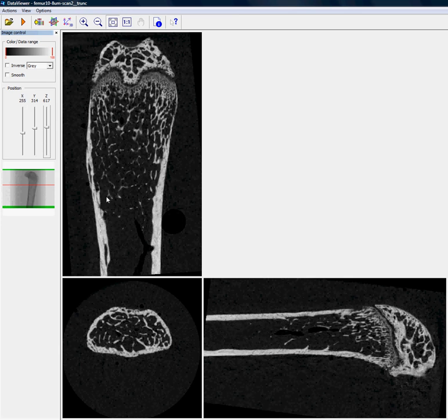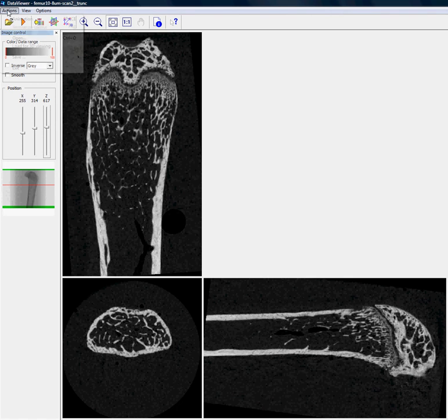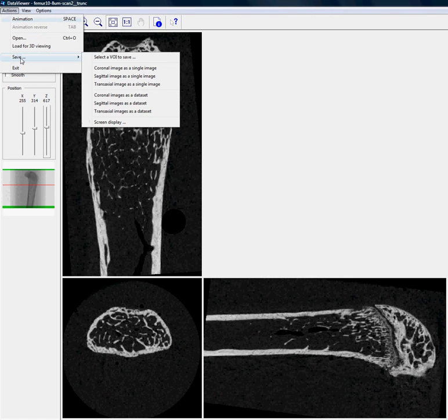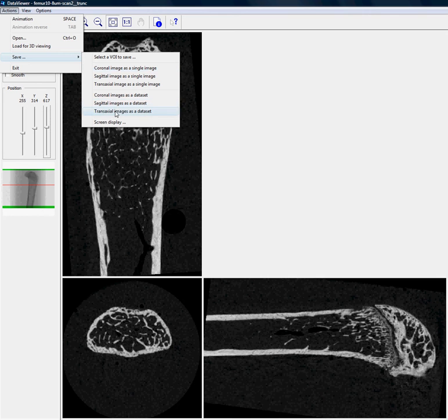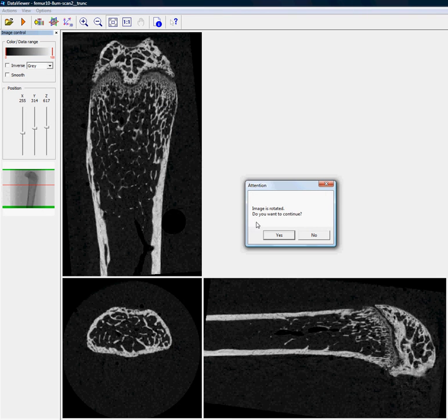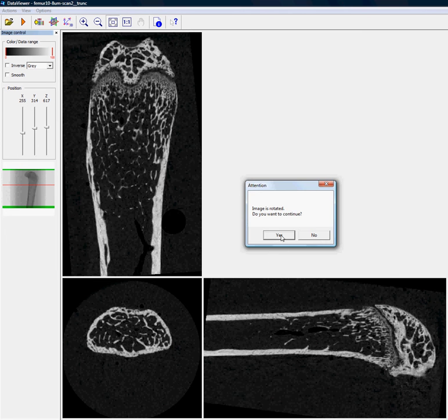So if we want to save the whole transaxial rotated dataset, we go to Actions, Save, and we choose Transaxial Images as a Dataset. It warns us that the image is rotated, but that's what we want, so we click Yes.